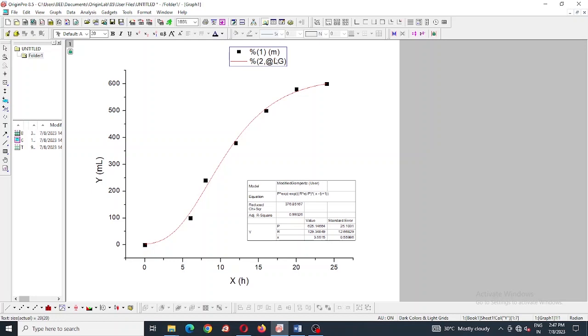I am going to add the unit in cumulative hydrogen production, which is represented by Y, also changing the name to modified Gompertz function.